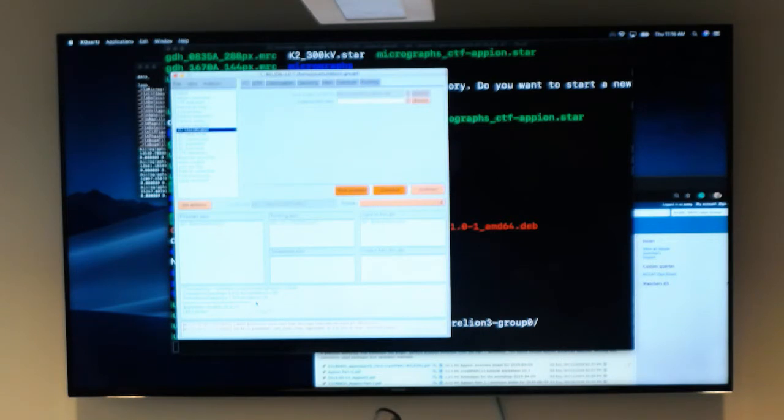Compute tab, okay, great. And running tab, fine. And then let's double click on that error code. I didn't link the directory, so that's why it has a problem finding the directory. Interesting. So when we close out Relion, type in nvidia-smi.